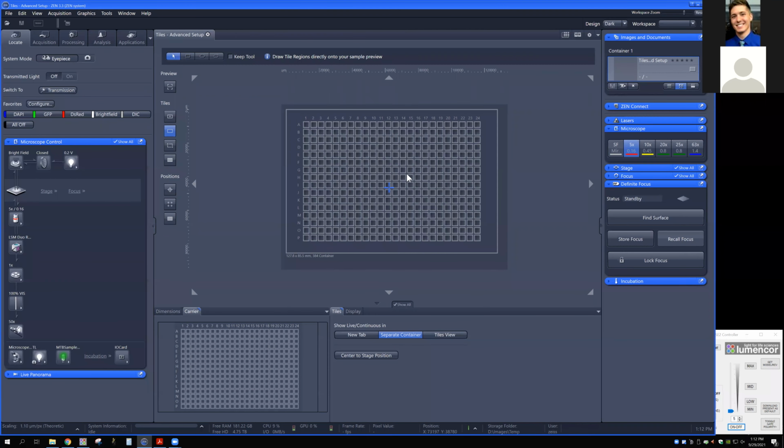Okay, it's not going to work yet. We still need to calibrate. Sure. But can we calibrate first and then we can use that to navigate? Yep, we can try. But we do need some way to look at it basically. So let's just make sure that bright field is going to let us see our different wells, and maybe what I'll do is I'll get you to try to move up to the top left corner.